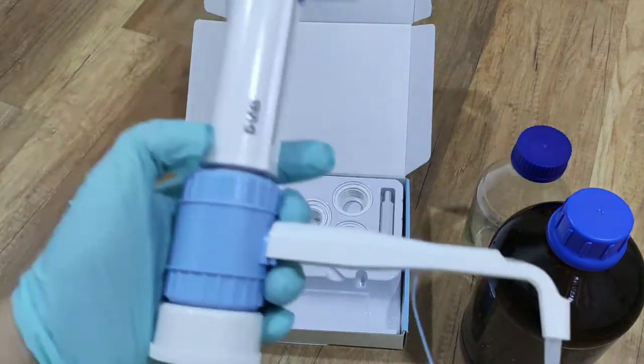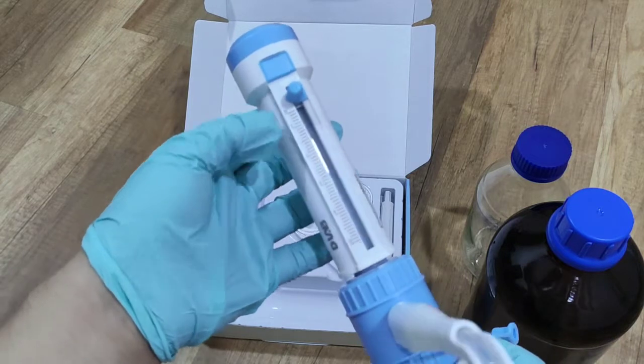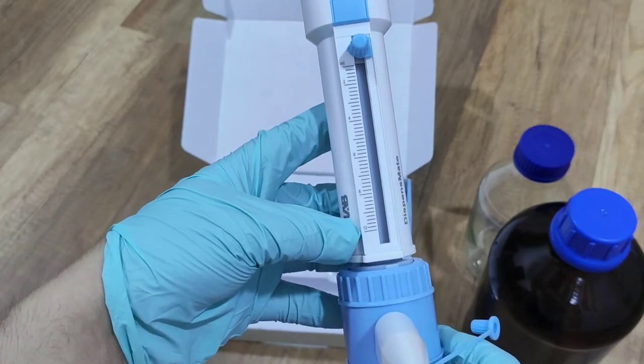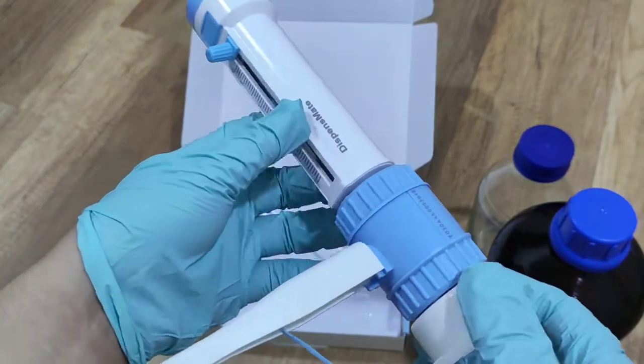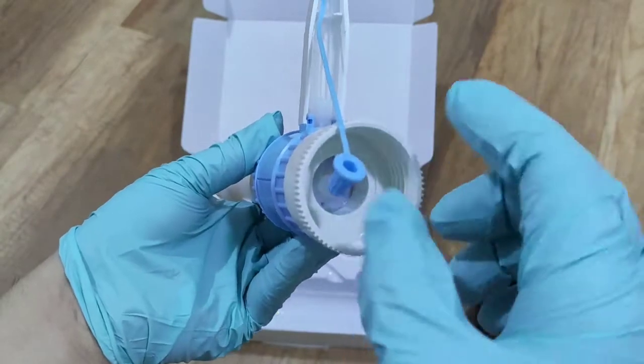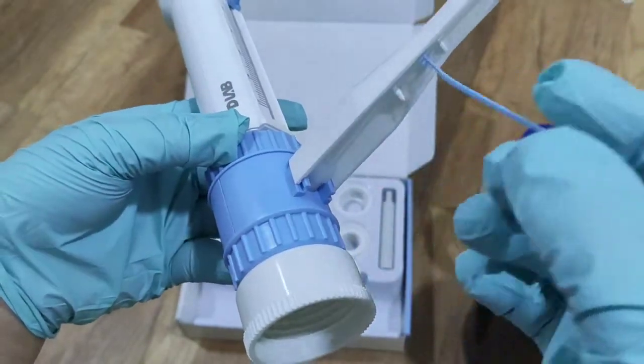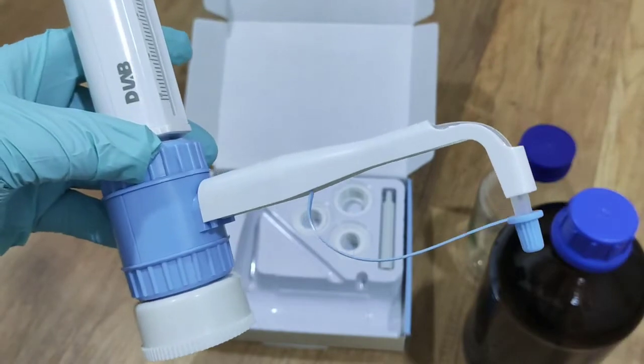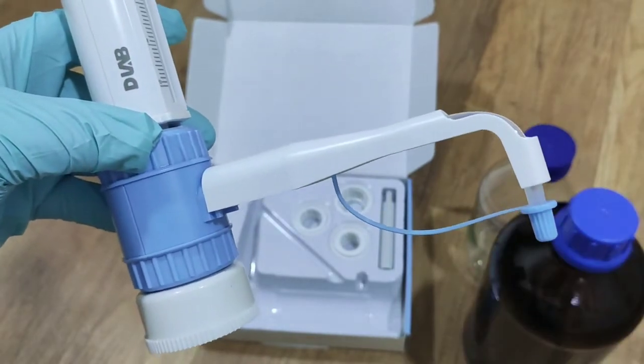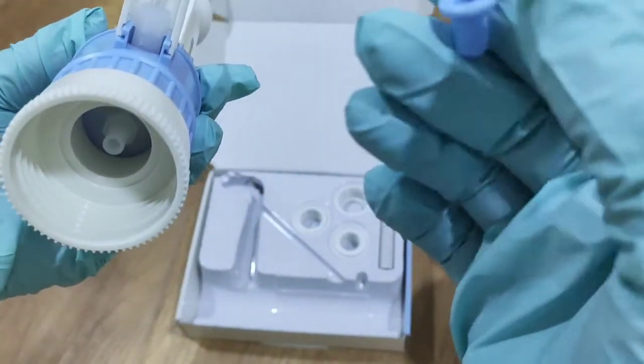This is the dispenser itself. You can see the volume marks from 0 until 10 ml, D-Lab. And this is the dispenser, the top. And here is the connection to the bottle. This one is to cap the tip. When we finish using it, we can cap it to protect against normal liquid dropout. This is the tip. It hangs there. Very convenient.